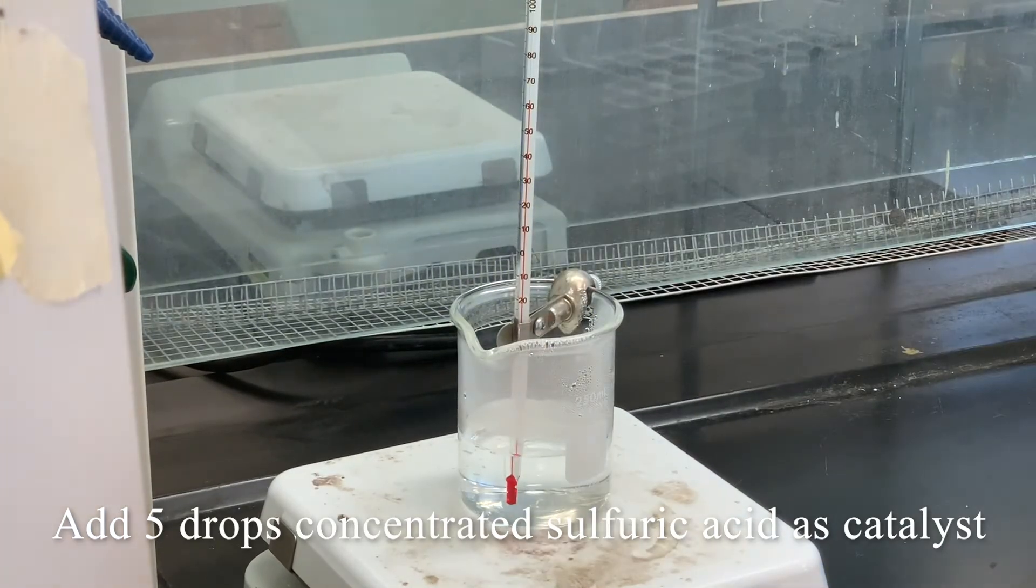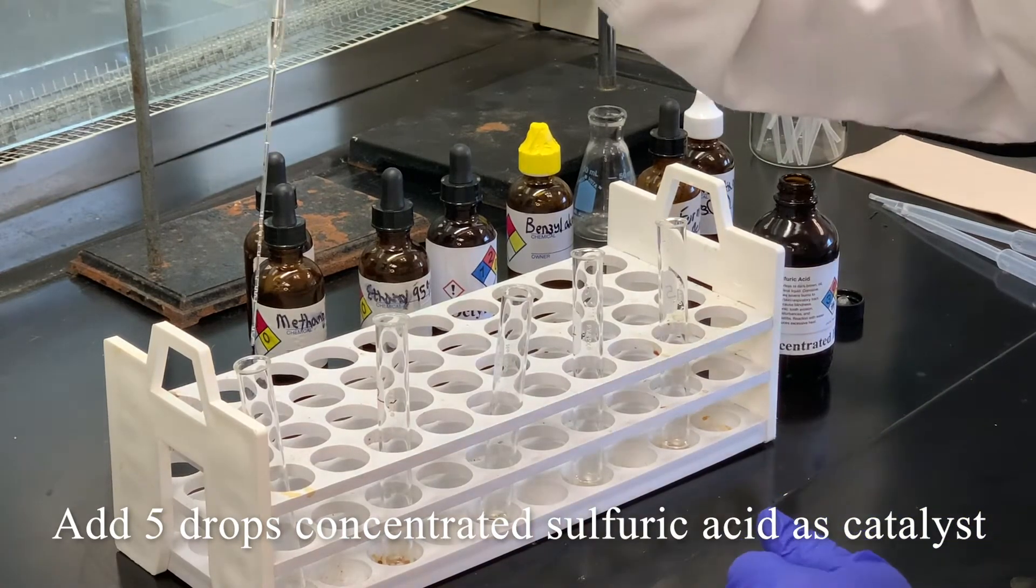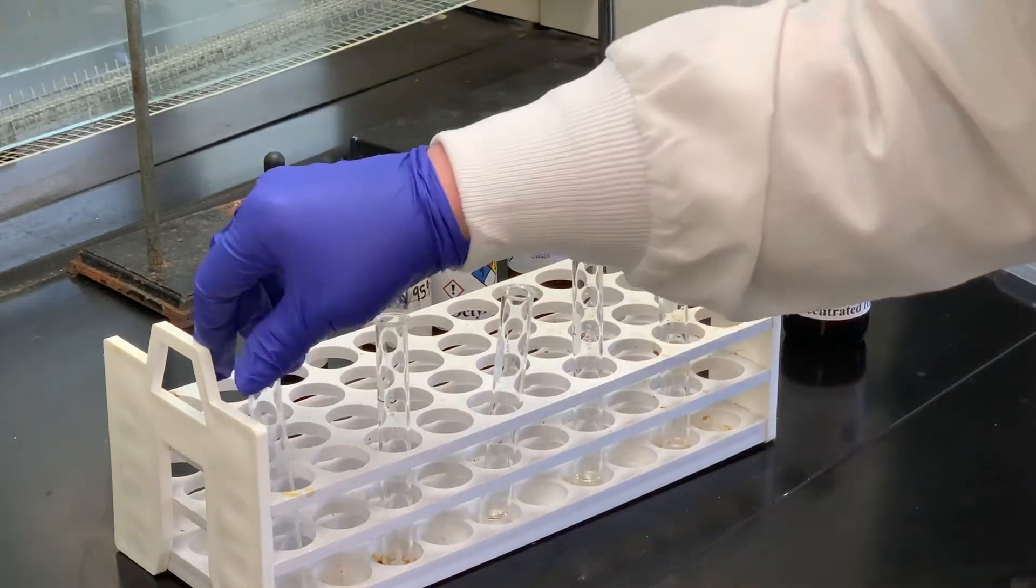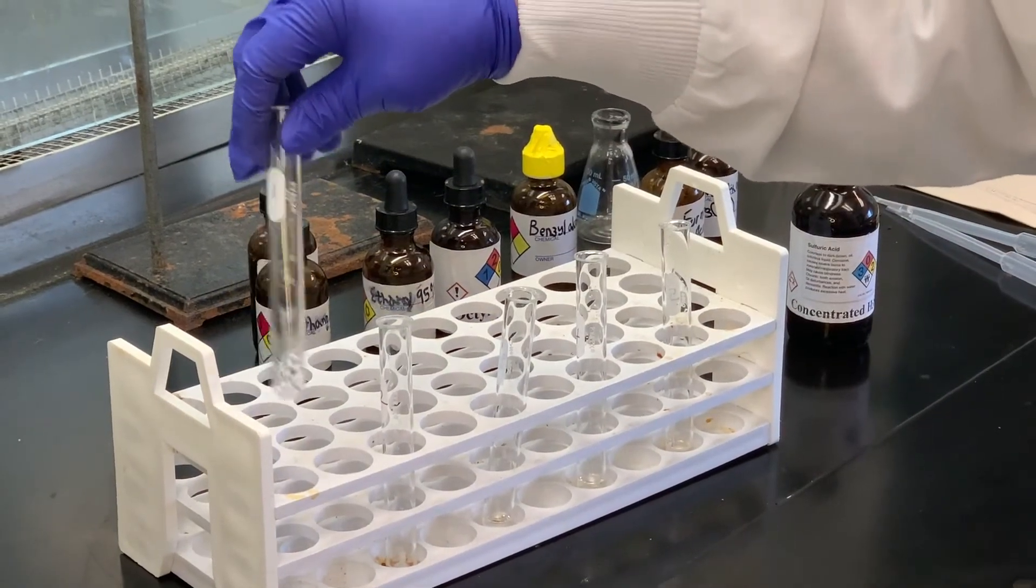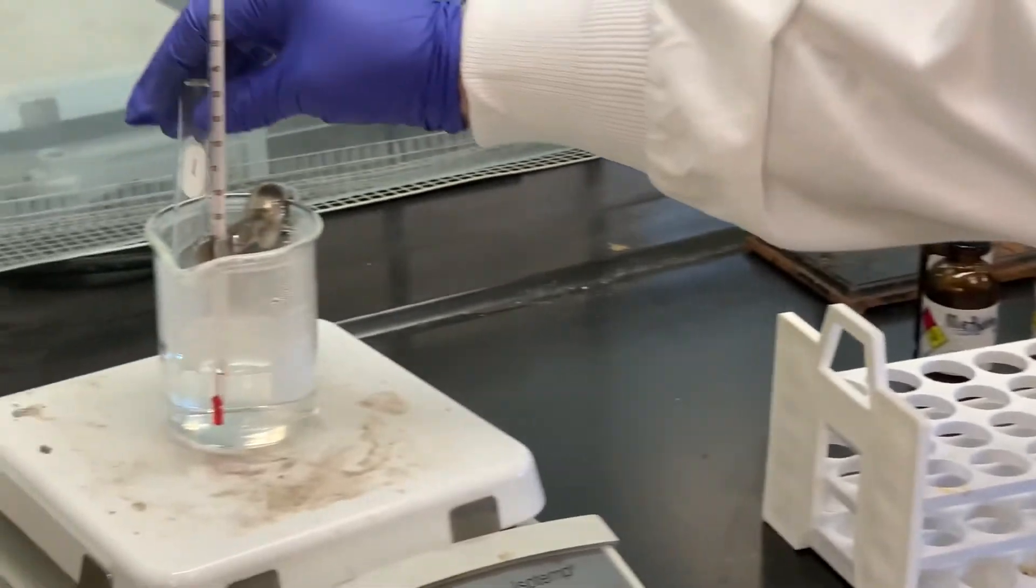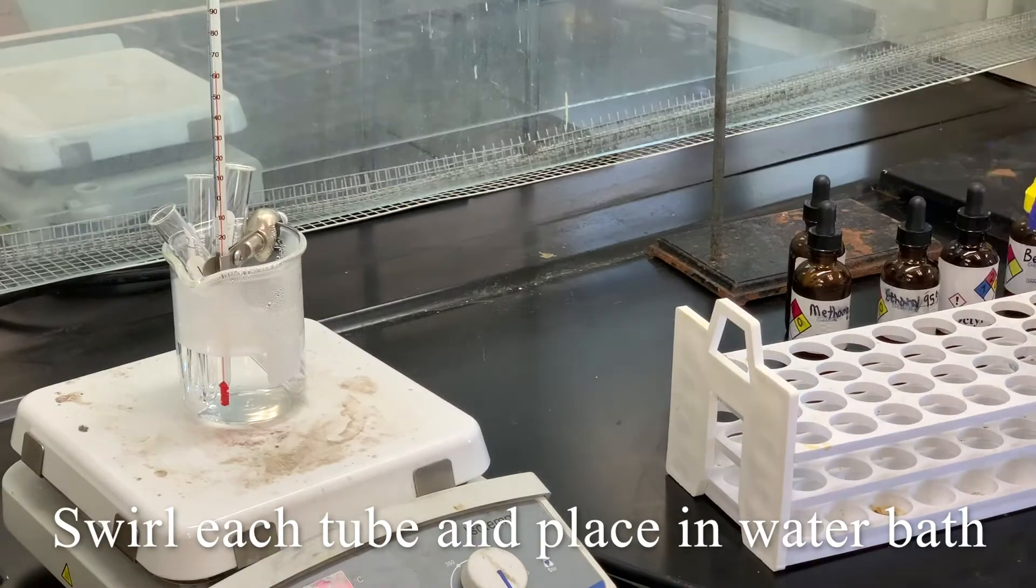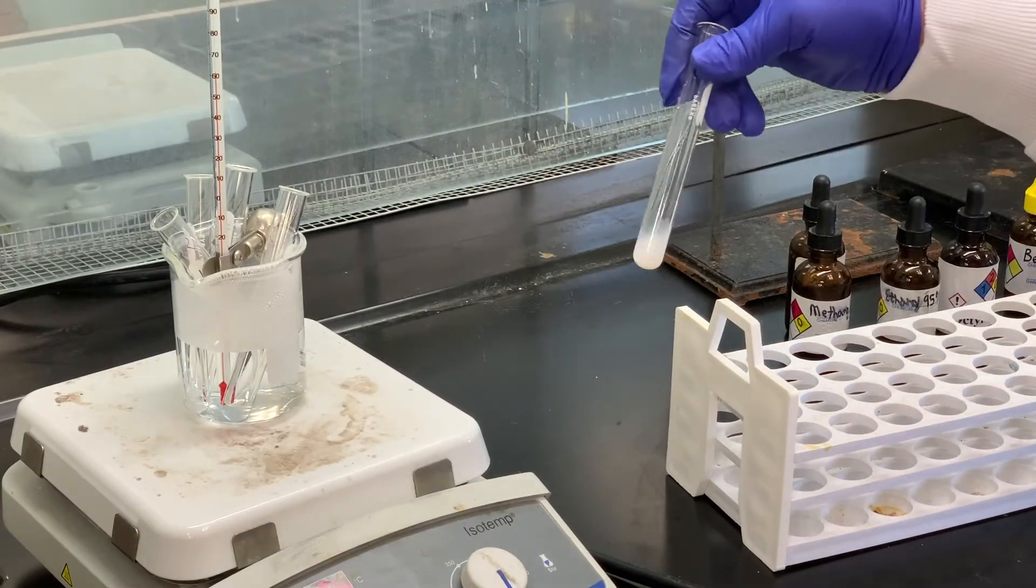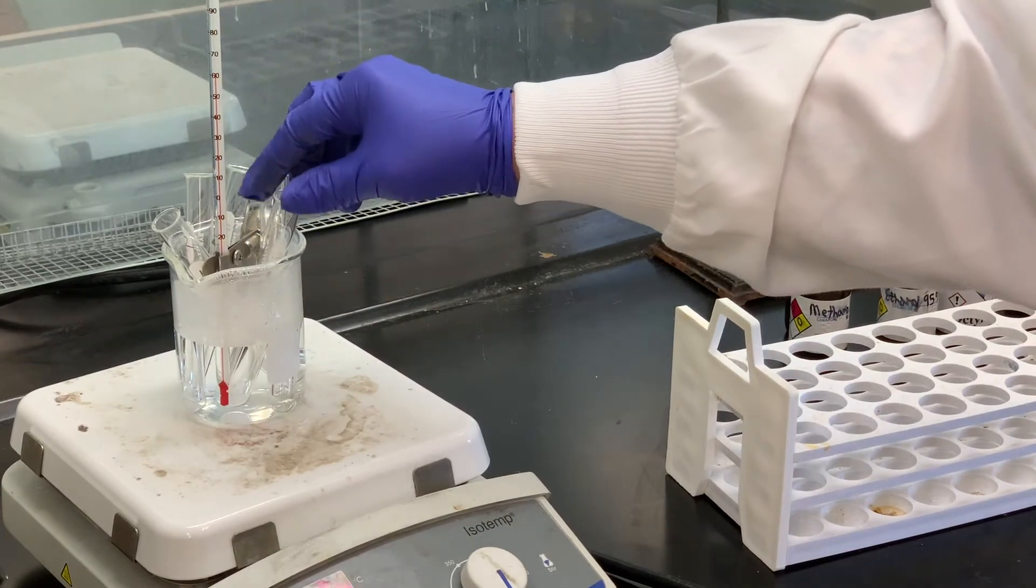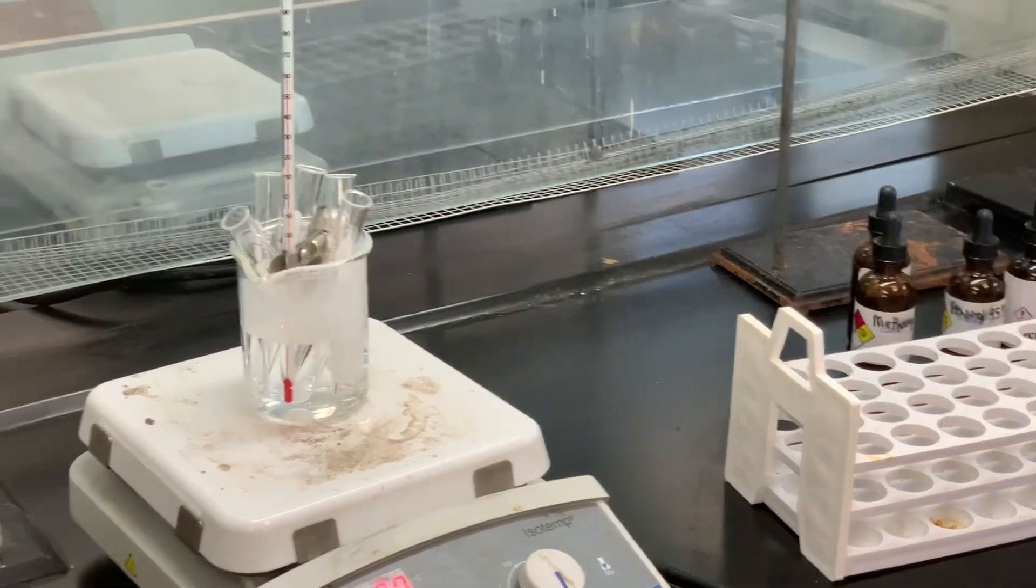This is concentrated sulfuric acid, so you always have to be careful. Make sure you wear gloves. If you think you get anything on you, you should change your gloves immediately. Now we certainly want to swirl that. And then we'll place these into the hot water bath. It's not uncommon for precipitation to occur when they're heated. That typically will go back into solution. So we'll keep a check on that. We'll heat this for about 10 minutes and then we'll come back and continue.